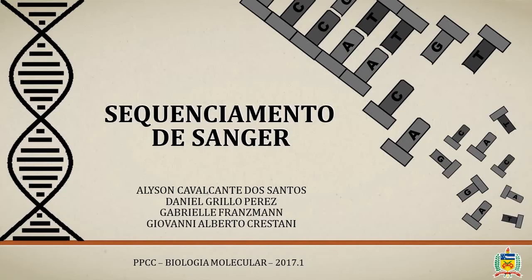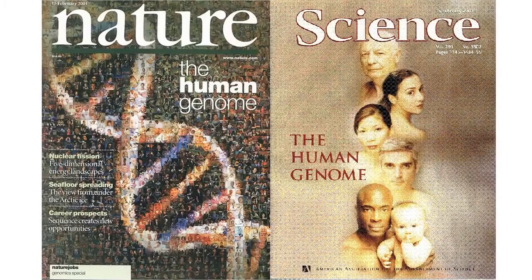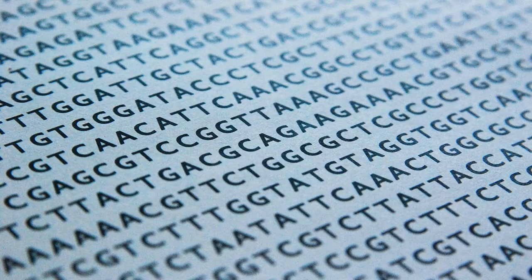What if you could read the information inside our DNA? In 2003, the Human Genome Project was completed, taking more than a decade and relying on the efforts of scientists from different nations, resulting in the decryption of our species' genome sequence of more than 3 billion base pairs.